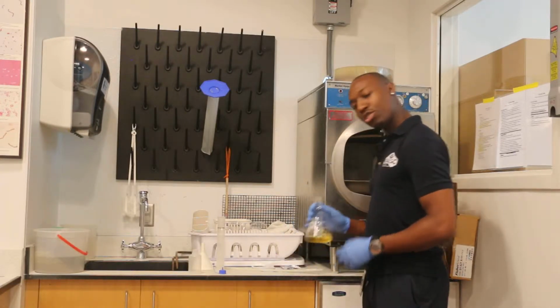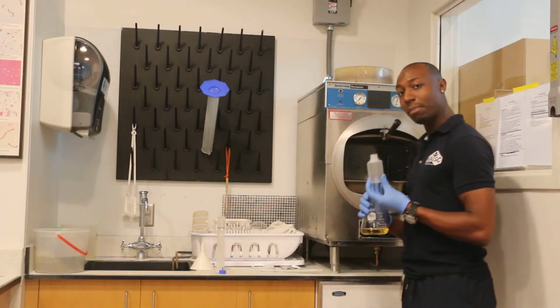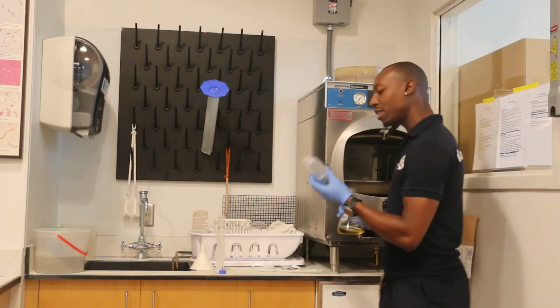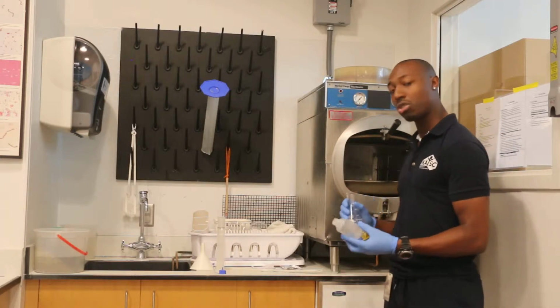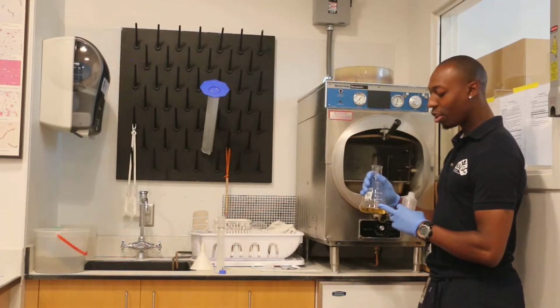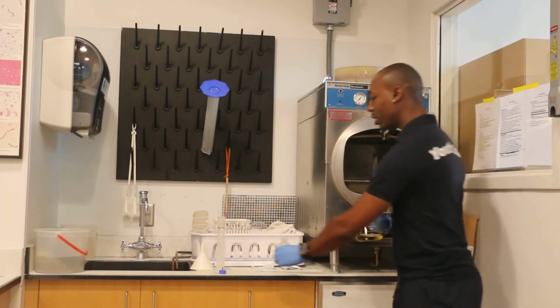Now this is a trick, okay? Because eventually our liquid is gonna have to be in these bottles. We're gonna have to actually place the liquid into the bottle, okay? Why is that important? Because the bottles right over there are being contaminated with dust bunnies or bacteria or anything like that in the air, okay? So we wanna actually sterilize these bottles by placing our liquid into the bottles and then placing the bottles themselves into the autoclave.